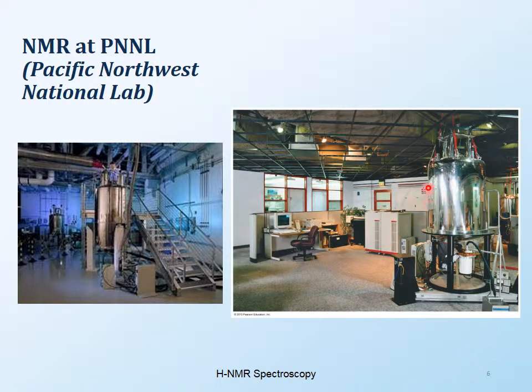So you have to provide liquid nitrogen in order to cool the magnet down. So really, the instruments require a good amount of maintenance in order for them to work. Most of the NMR instruments would be found in the basements of most of the departments or labs, so that you're not affected by anything else.